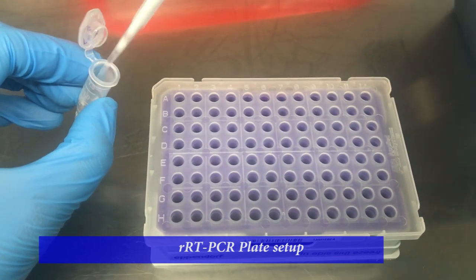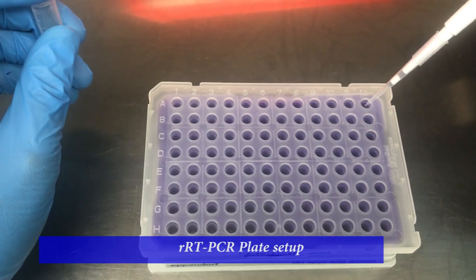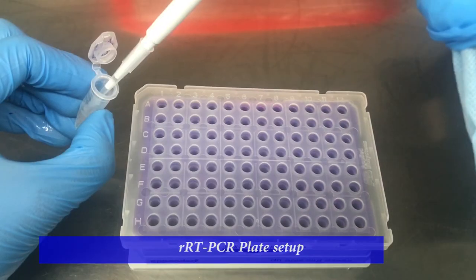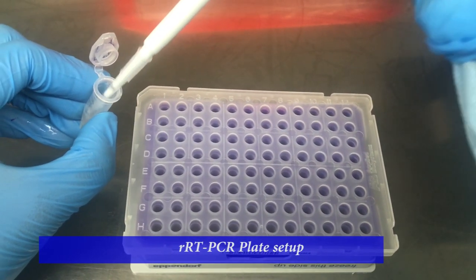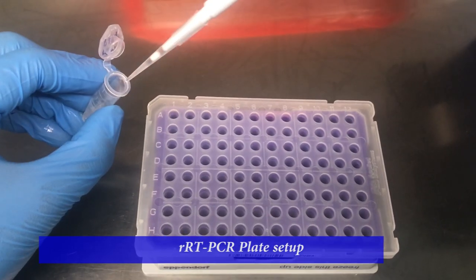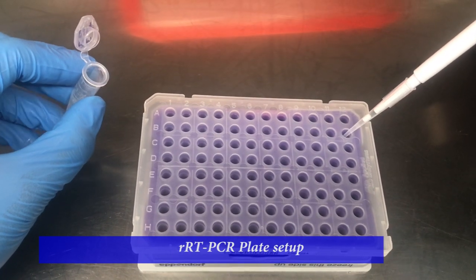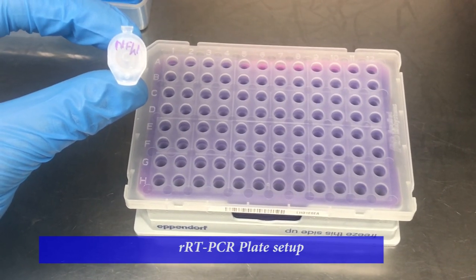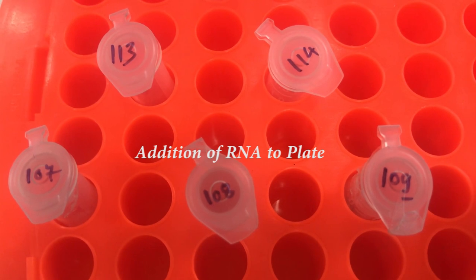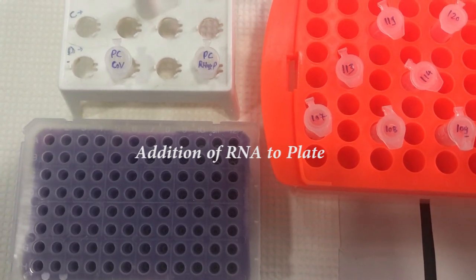Take a 96 well real-time PCR plate and place it on a PCR cooler. Assign one full row for one target. Dispense 20 microliters of the master mix of each target into the designated wells. Add the sample RNA to the plate in the RNA room.